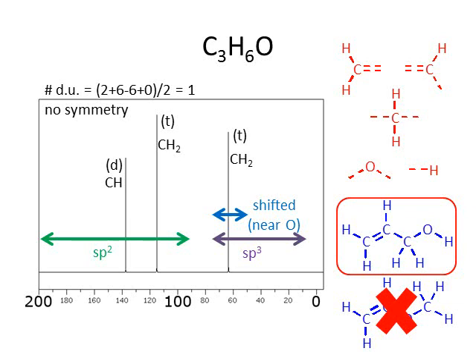But in my next presentation, we're going to add another piece to the puzzle. We're going to look at proton NMR spectra and find out that that is also a very powerful technique to solve structures. And then we'll find that we could either solve structures with proton spectra alone, or we could combine proton, carbon, and even IR together, and other things as well, in a very powerful way to solve the structure of organic molecules. All right, come back in part 3 of this presentation, and you will learn about proton, also known as 1H NMR.